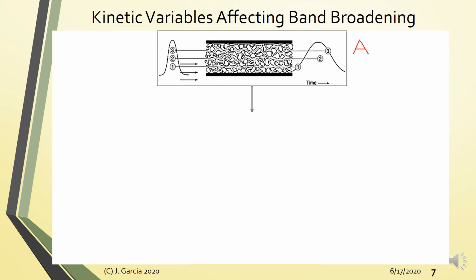If you are using solid stationary phases, normally in terms of particles, or even liquid bonded on solid particles, then basically you have a densely packed column. Now, the mobile phase, along with the solute, will travel along these interstices, the gaps between these particles.